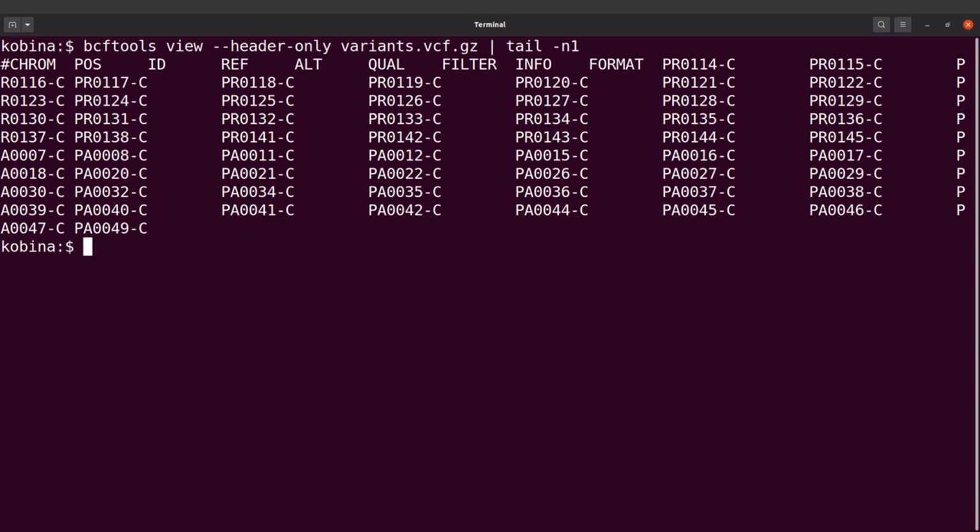Let's continue with what we want to do. So let's just say I want to extract chromosomes. Okay, the chromosome list. I want to see what chromosomes are there in our sample. Then I can say BCFTOOLS query, and I'll say -f. So the BCFTOOLS query -f is what is used to extract information from the various headers. We have chromosome, position, ID, ref, etc.